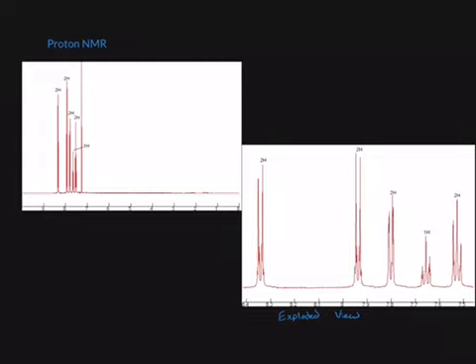It is not part of our splitting or anything like that. We notice that we have 1, 2, 3, 4, 5 groups for hydrogen, so that means we're going to have 5 different environments total. That will help us later on. Now, the 2s and the 1 here are our integration numbers, telling us how many hydrogens are in each of the environments that we're going to find.